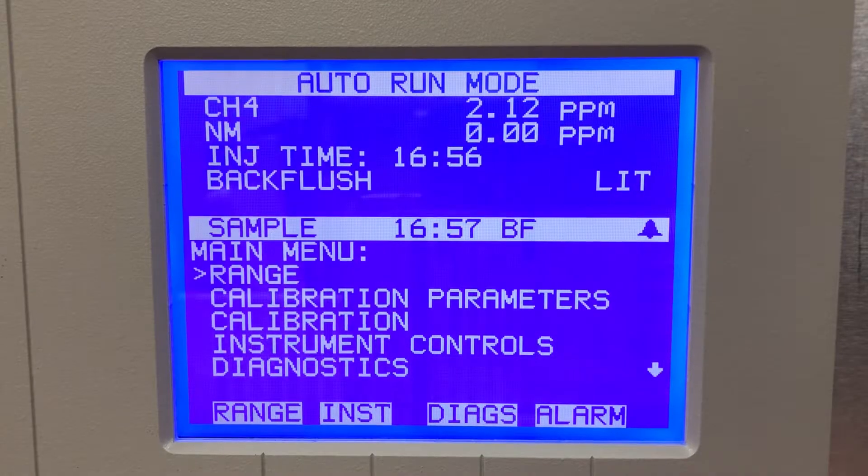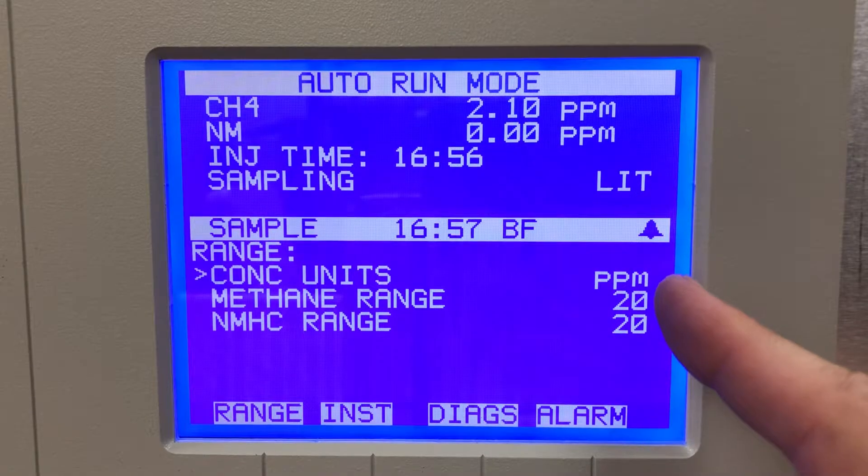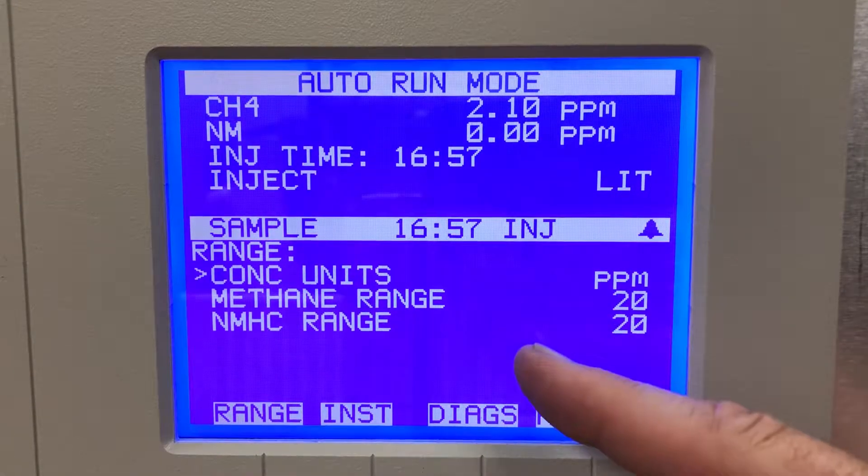Looking at the menu, they have a range which we can change from 20 ppm up to 200 and then up to 2000, so there are some preset ranges — 20, 200, and 2000 ppm — for the methane and non-methane.